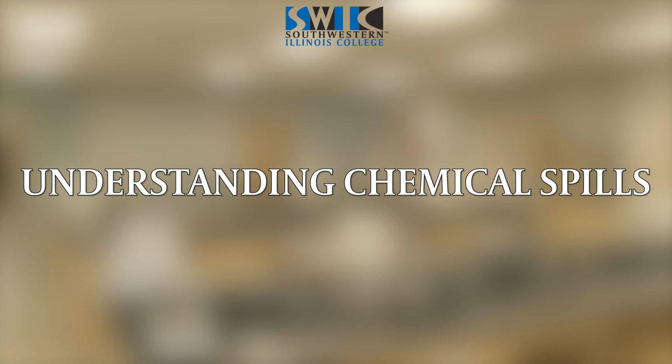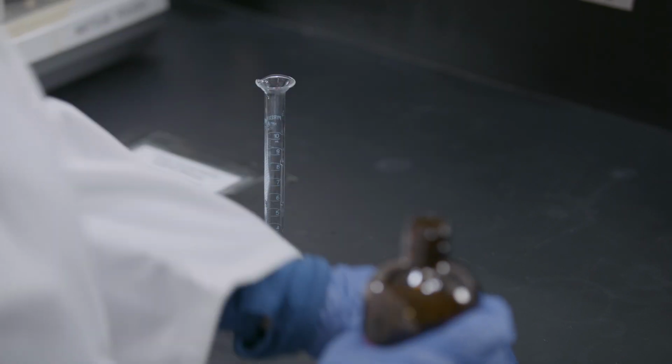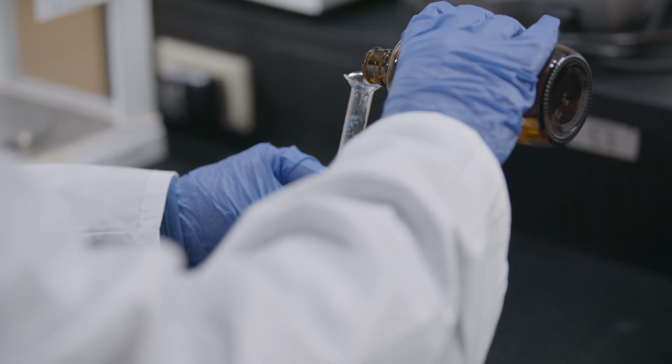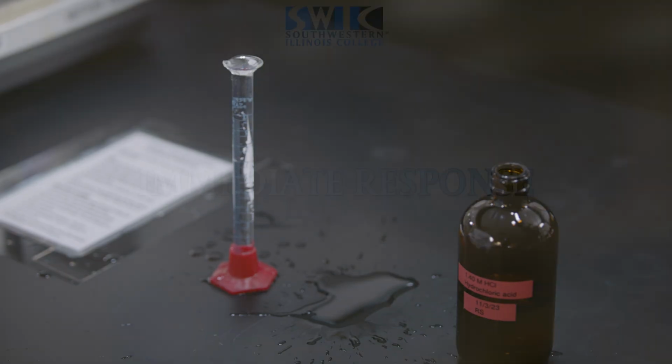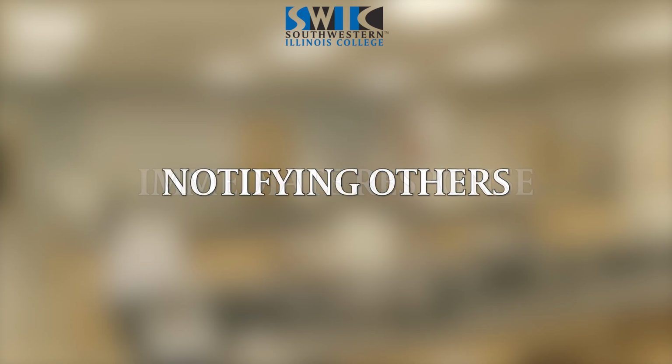Chemical spills can happen, no matter how careful we are. The first step is to understand the nature of the spill. Is it a small, manageable spill, or is it a larger incident that requires immediate attention? For small spills, you can take immediate action. Put on appropriate personal protective equipment and use spill kits to contain and clean up the spill. Always notify others nearby if a spill occurs, even if you think you can handle it on your own. Safety is a team effort.